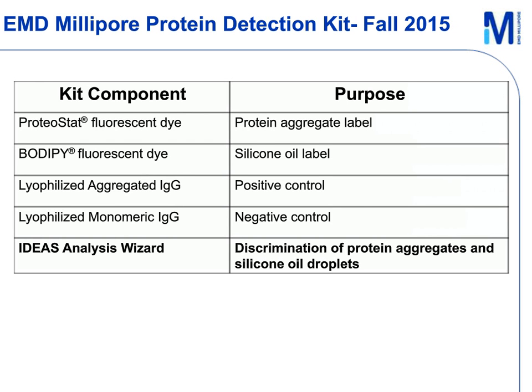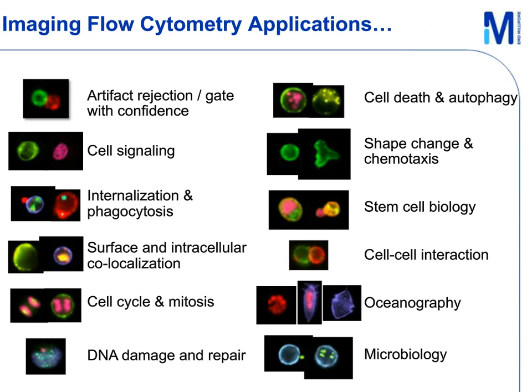I also just want to remind you that particle analysis is only one of many applications possible with imaging flow cytometry. Here's a list of some of the most common applications that imaging flow cytometry has proven useful for. However, this is by no means a comprehensive list of what is possible.